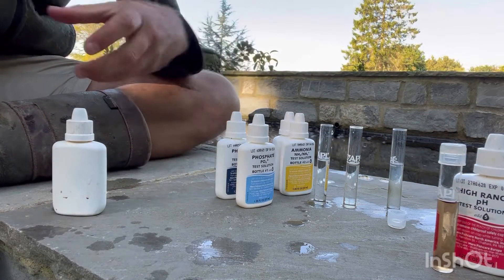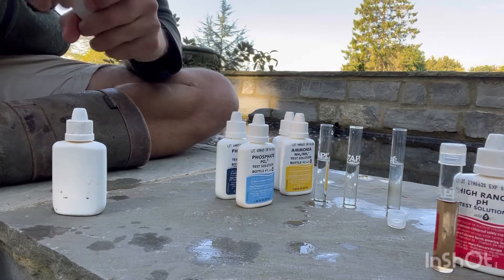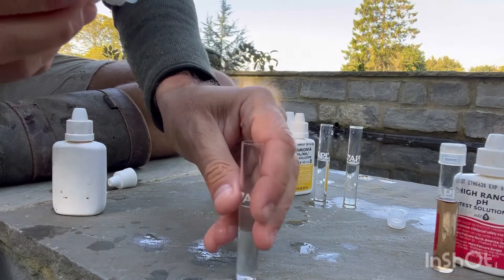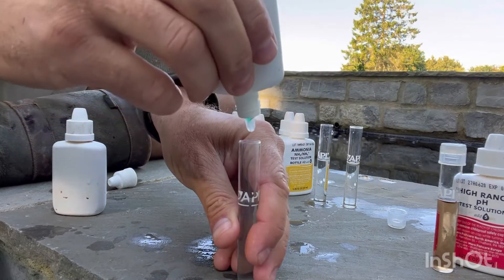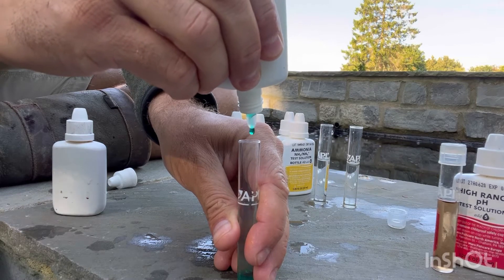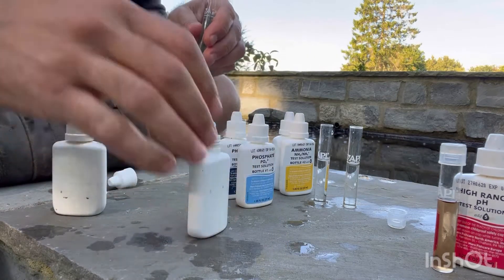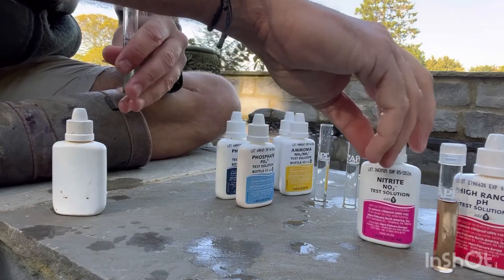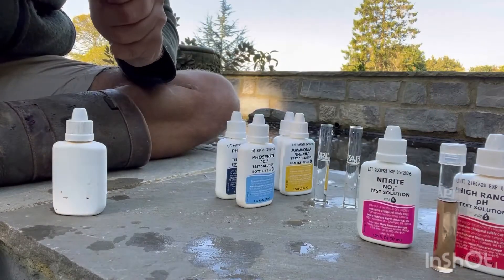Second one is nitrite. This is five drops. Lid back on, out of the way, lid on.